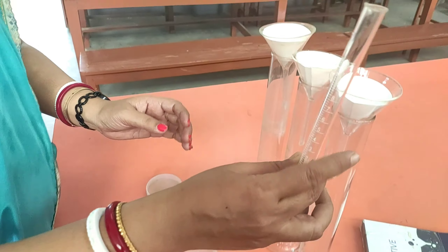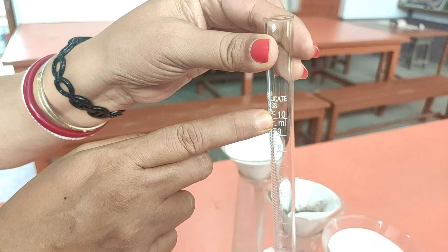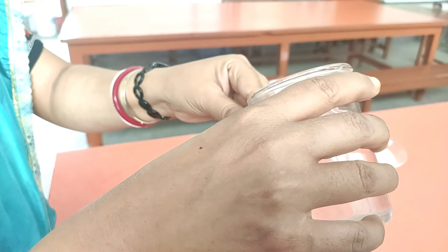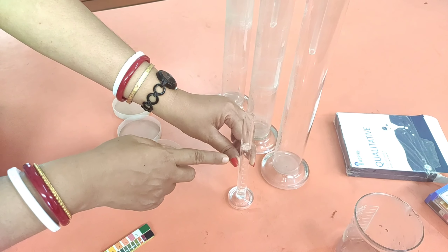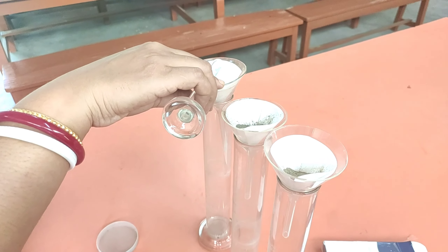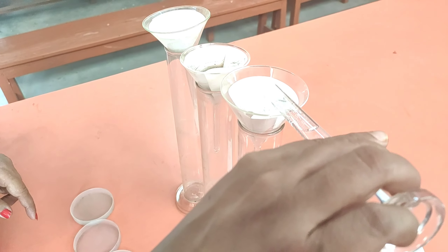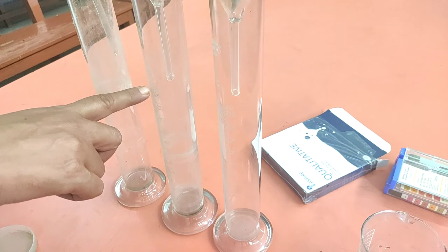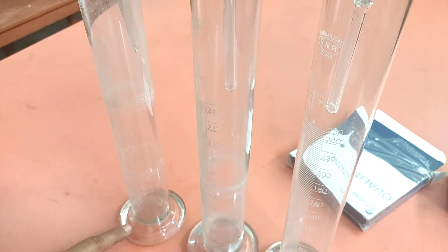This is a 10 ml measuring cylinder — you can see the markings. I will be collecting 10 ml of water and pouring it into these three funnels. This is 10 ml water taken in the measuring cylinder. Now I will be pouring it into sample A, and into the other samples also I will pour 10 ml of water. I will be waiting for five minutes, and drop by drop you can see the water is falling into the container.